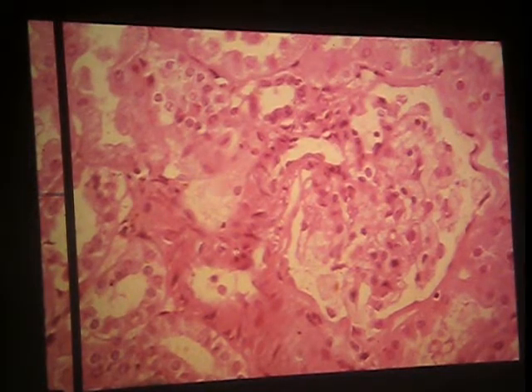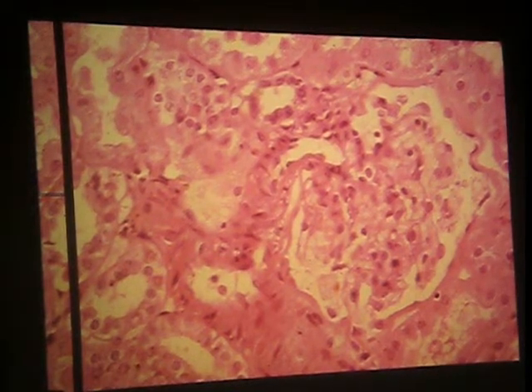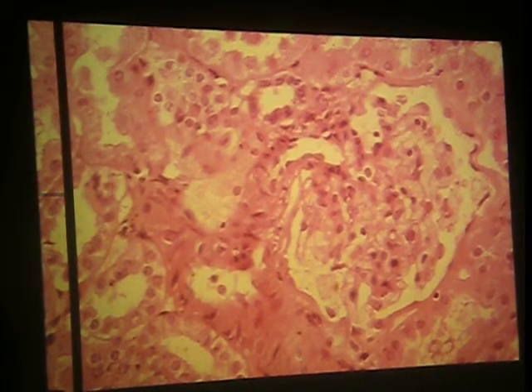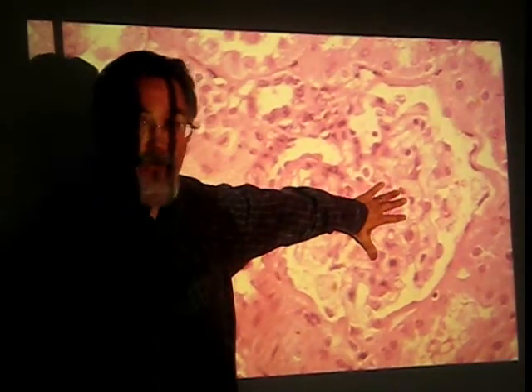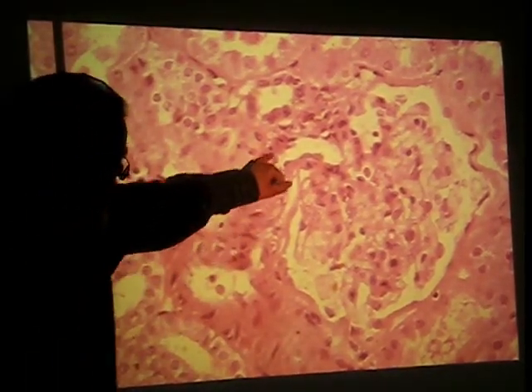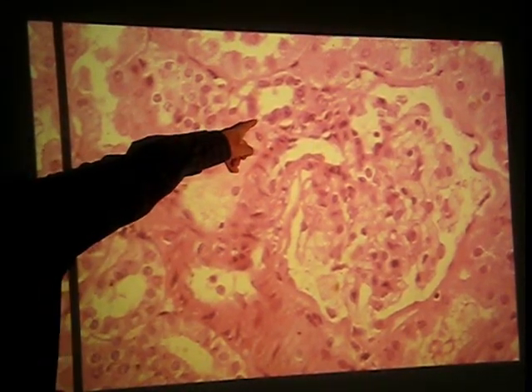All right, we've got a renal corpuscle with histologic evidence of the juxtaglomerular apparatus. Do we see it? So clearly, let's start with what we know. Glomerulus. That kind of has a nice look of an afferent arteriole, right? But this puppy is the ringer, the macula densa.